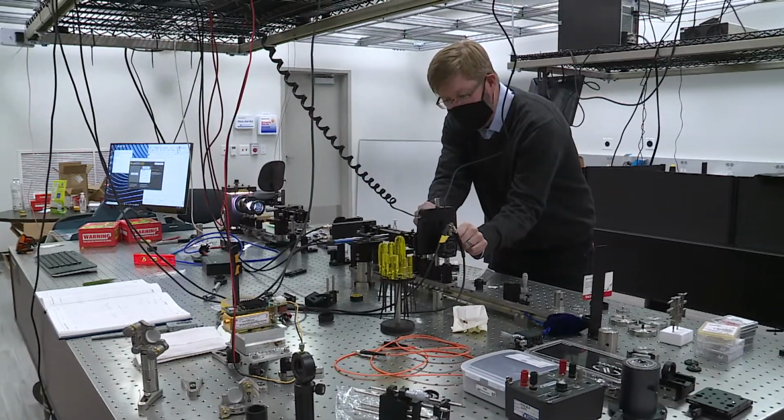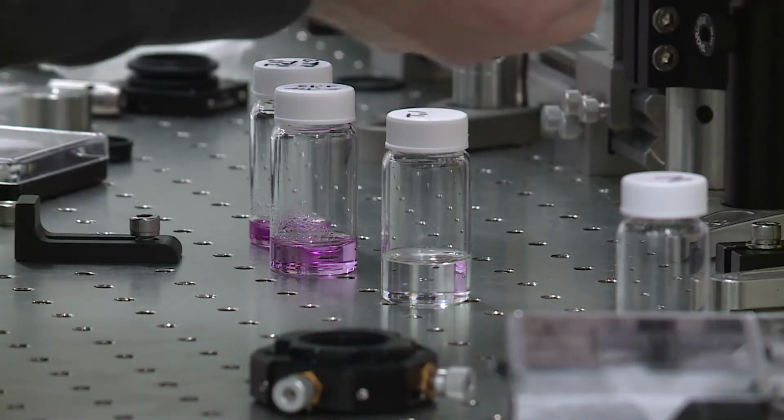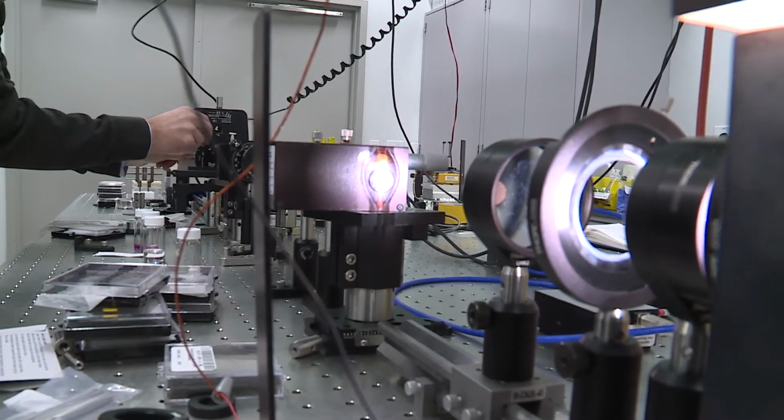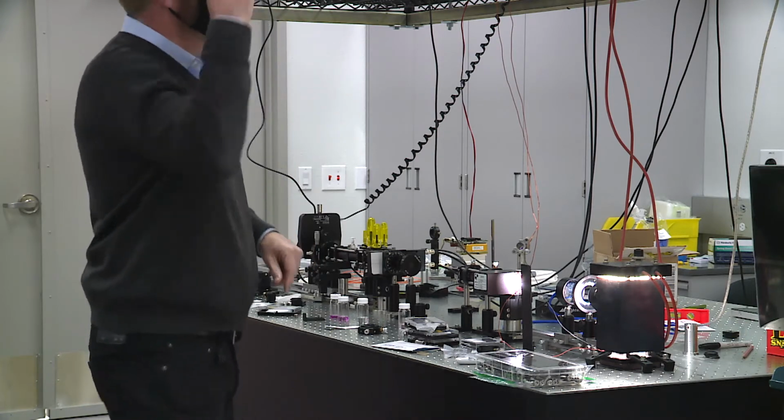One of the things we're very excited about our facilities in PAÍS is that we now have, as far as we understand, the only lab in the world that can make these types of measurements from the femtosecond time scale to CW. So that's just continuous wave, like a laser pointer. And we recently received funding from the National Science Foundation to continue that work. Part of that work was originally to develop this instrumentation, and now we'll use it to make measurements on these solar materials.